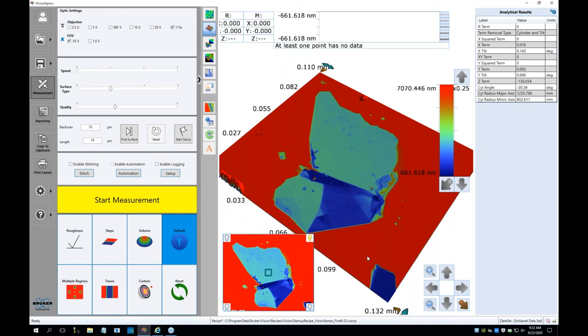Yeah, I also had a question where someone asked how it comes that we can reach 200 nanometers true lateral resolution with just a central wavelength of 600 nanometers. It's far from lambda over 2. Here the idea of the measurement mode of white light interferometry is that we have an unprecedented vertical resolution, and with this vertical scanning mode, we call it VSI, or we can call it USI.